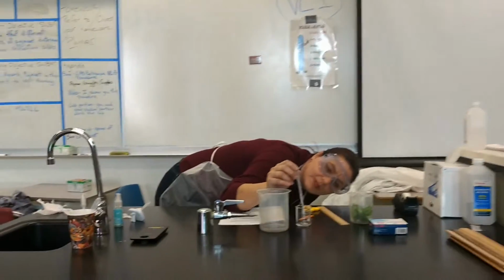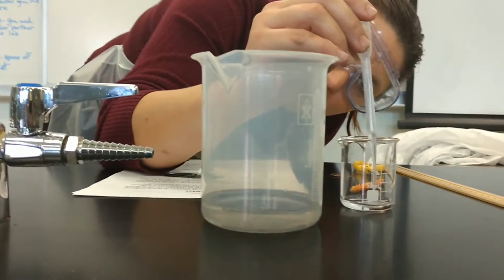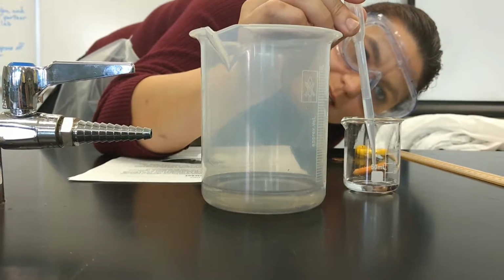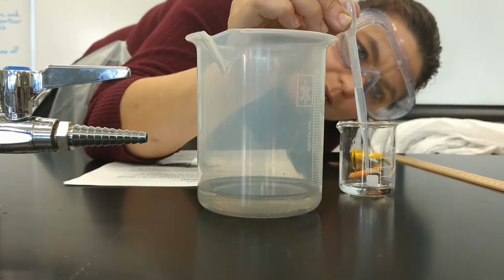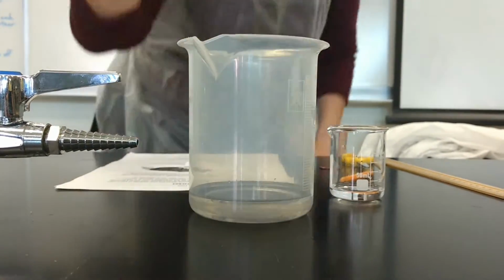Matthew, can you come in, please? And make sure that when I measure it, the 10 milliliters is right at that level. Now the 10 milliliters is also 1 centimeter. Not everyone has the same looking beaker, but it will be the same height. All right, there we go.